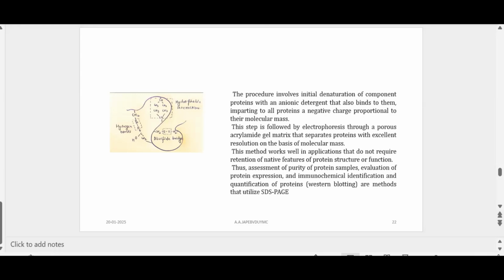But here I'm talking about proteins. So when you have added urea to the gel, then additional information about the macromolecular structure, say, of the proteins can be obtained. Many proteins are studied with the help of urea as a destabilizing agent, and then the protein is electrophoresed.